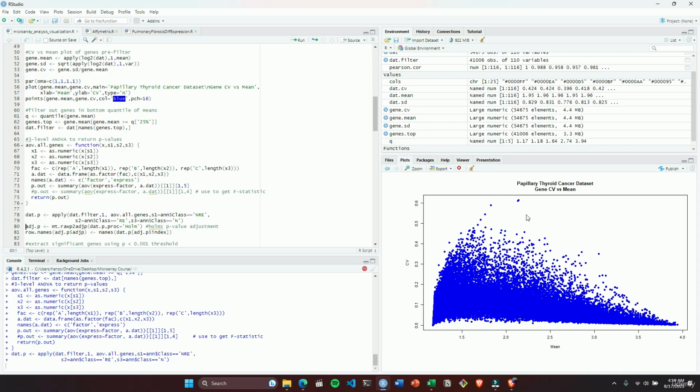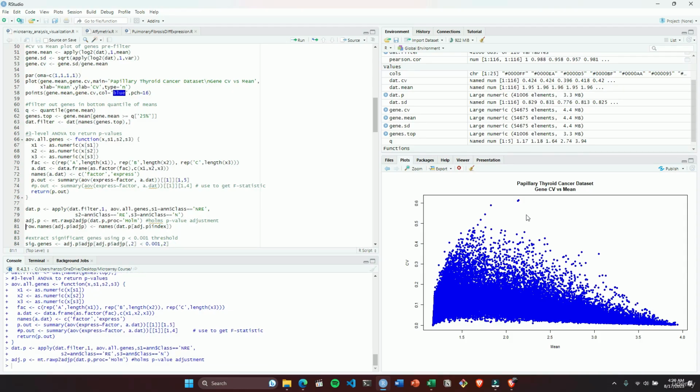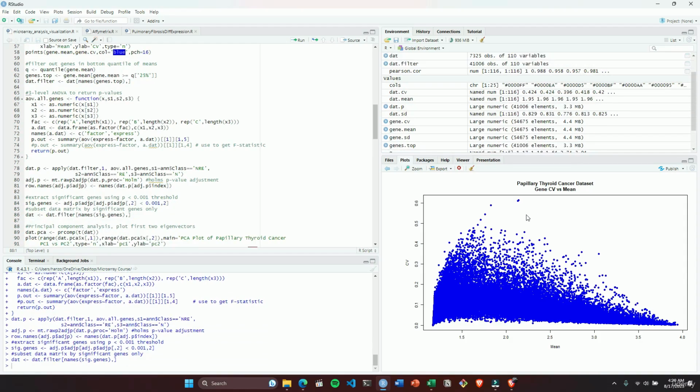You can see these plots are much different than the plots that you got in your graphical user interface. Here you have the freedom of getting the plots that you require for yourself. You can also change the color scheme. You can also change the values of the genes. That is all totally dependent on you. I think now it is again doing the adjusted values. The p-value is now being adjusted again.